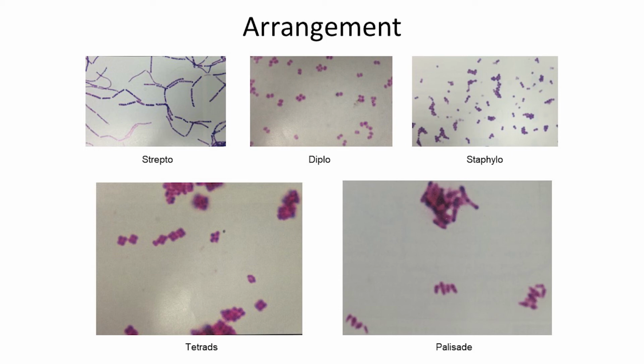And if you were looking in an area where there wasn't more white space in the bacteria, this is a great example of where arrangement becomes very difficult to tell. You might look down here and you might go, oh, this looks like staphylo because they're all clumped together. But if you spread out to a more white area, a spot with fewer bacteria, you can see this repeating pattern of 4, which is not natural. This is something that is happening not by random chance, but by the actual process of the bacteria to create these tetrads.